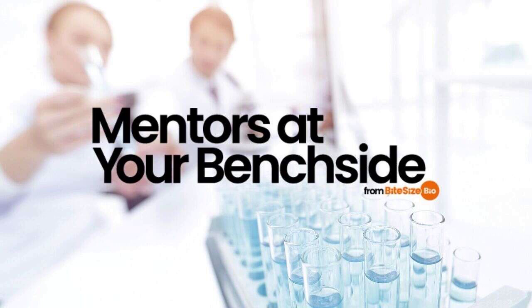In such cases, if, say, the green signal colocalizes with the red signal and the picture is mostly yellow, no statistical measurement is needed. But if you don't see overlap, it doesn't mean it isn't there. One of the probes might be significantly less bright. This creates the illusion that there's no colocalization. That's to say, the intermediate colour that we see can only appear if both probes have the same intensity. For a visual example of this, check out Figure 1 in the corresponding article. That's why conclusions based on visual determination alone often lead to false negative results.